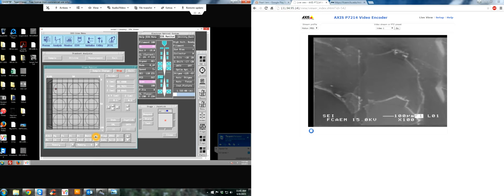What I like to do is save their locations on the stage monitor. So for example, if I click on this, this is plagioclase, so this will move right to the plagioclase standard. And I've already saved olivine on this, so if I just click on this button, it'll move us directly to olivine.